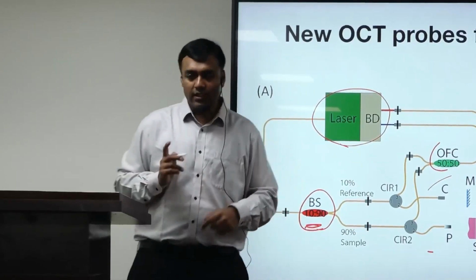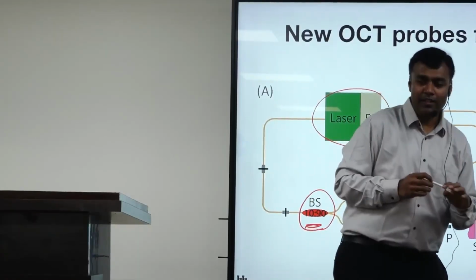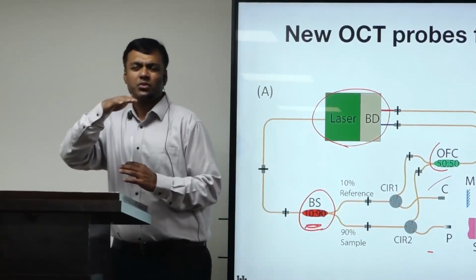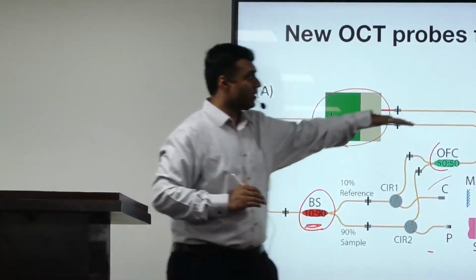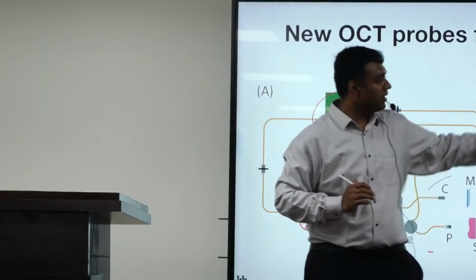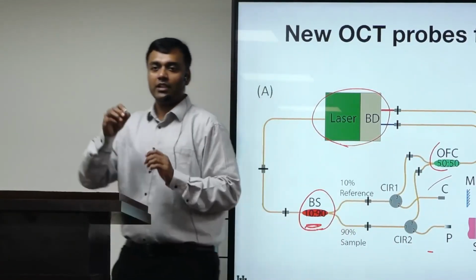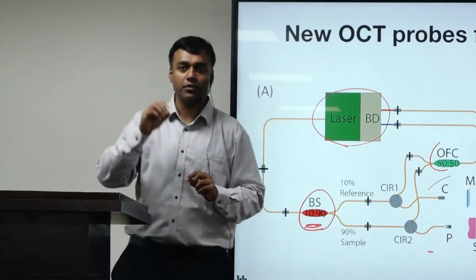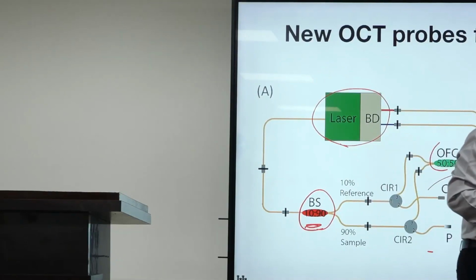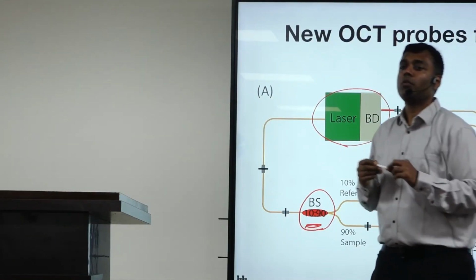The thing about the piezoelectric effect is that the deflection is quite small, meaning even with a substantial voltage, the deflection is very small, like microns. You don't want to deflect the beam by just microns, right? You want it to be big, you want to image a large area. But this deflection is very small. So what do you do?